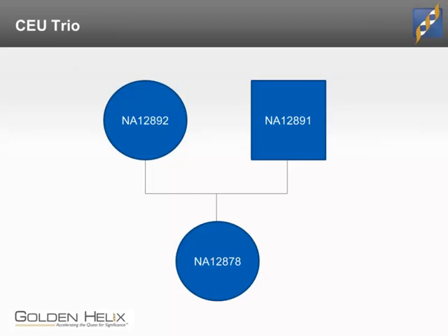As this trio is from the 1000 Genomes project with no phenotype information other than gender and population, for the sake of demonstration, we will treat the child as affected and the parents as unaffected. We will look for rare recessive polymorphisms, compound hets, and de novo mutations. This trio includes a female child, so we will not look for an X-linked mutation.